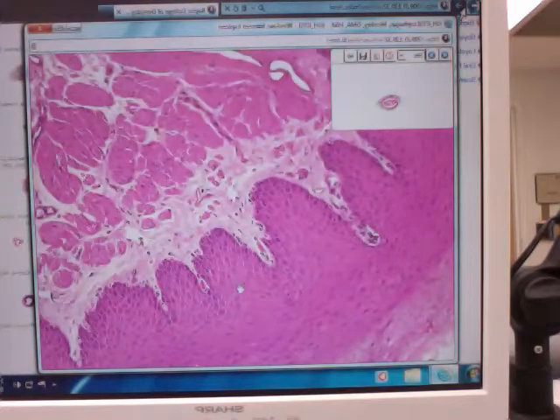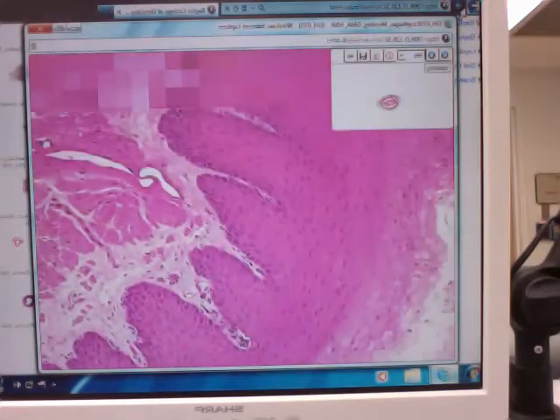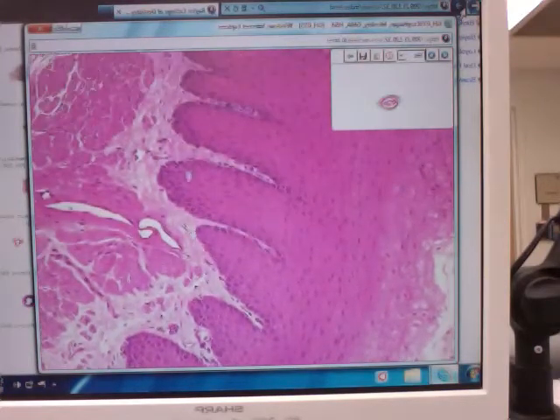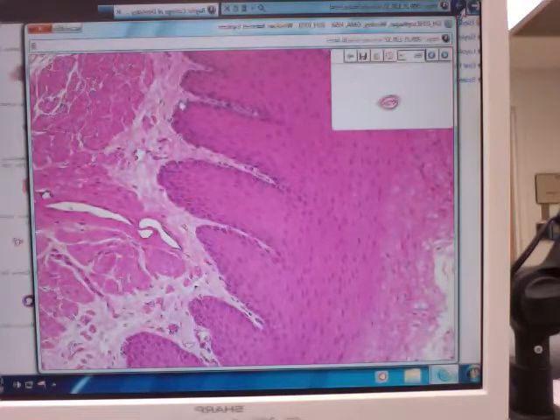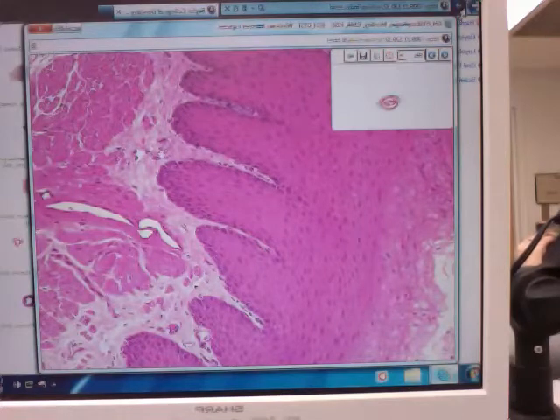And then, as typical, just deep to and supporting this epithelium, you can see this pink tissue in here. It's loose connective tissue. You don't have a real big thick layer of it here underneath, like you do in some other places, because of how this organ's arranged. But this is all loose connective in here. Then we'll get into some dense connective tissue out in here.